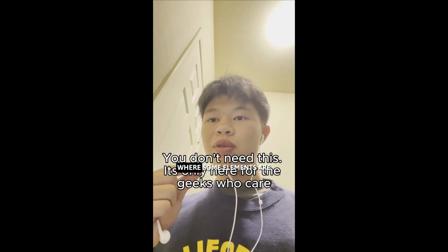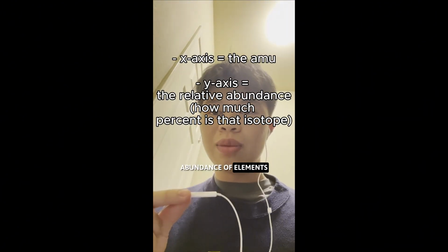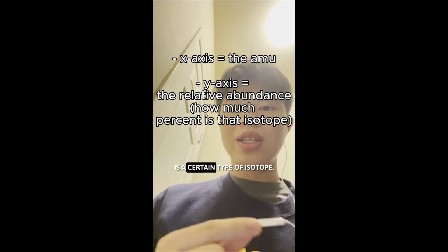Mass spectrometry is a technique where a sample of some element is blasted with energy and ionizes, and since isotopes have different masses, they deflect differently, and that's how we can measure how much of each isotope we have. Blah, blah. You don't need to know that. All you need to know is how to read the graphs. So it measures the relative abundance of an element on the y-axis. That's basically what percent of that sample is a certain type of isotope.